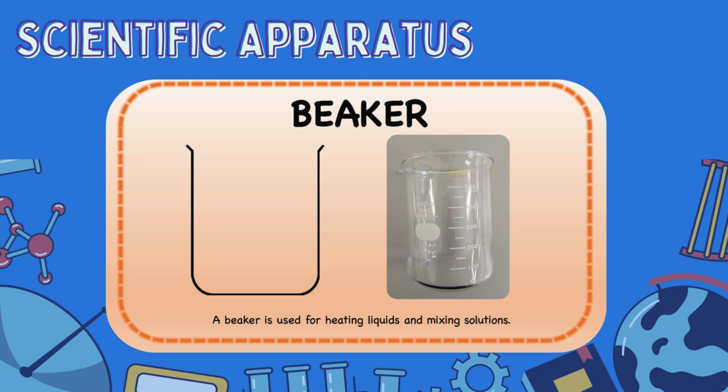First, we have a beaker. A beaker is used for heating liquids and mixing solutions. We don't normally use it for measuring liquids, even though it does have the graduations down the side. It's not particularly accurate.